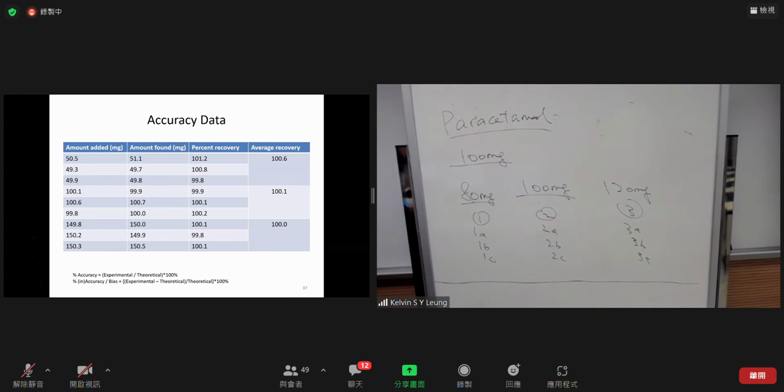Okay, you study about your industry or your international guidelines. Okay, so they will have some guidelines for you. What's the acceptance criteria when you're performing the accuracy in the method validation? Do we have to follow all 100, or actually maybe some analytes we can accept maybe, let's say 80% recovery will be fine. Okay, so it depends, but please check according to your guidelines first.